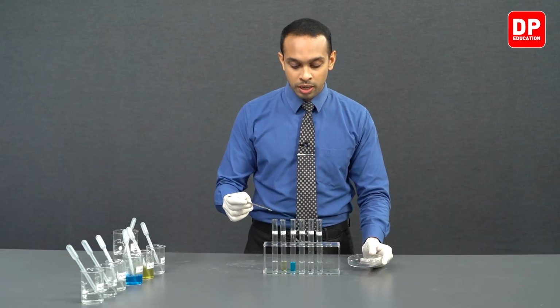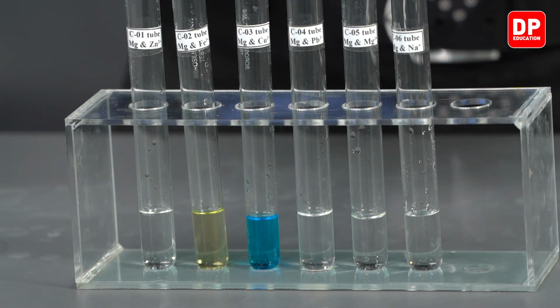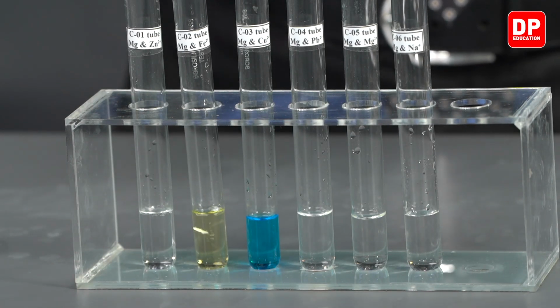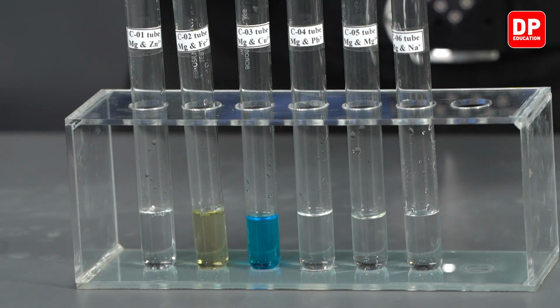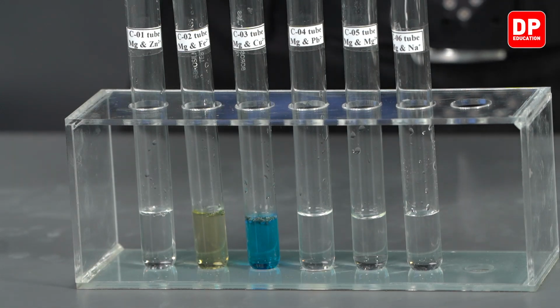So we are adding a small amount of magnesium into our zinc sulfate solution, a few pieces of magnesium into our iron sulfate or ferrous sulfate solution, and then we have copper sulfate solution here.